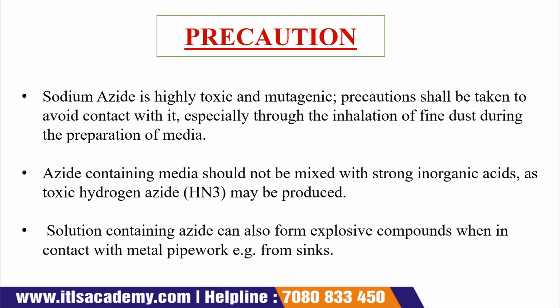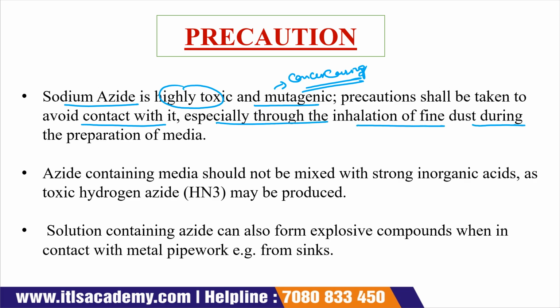Now the next is the precaution. When we perform this experiment, we have to take some precautions. Sodium azide is highly toxic in nature and mutagenic. Mutagenic means cancer causing. That's why when we are handling this media, we have to handle it very carefully. Precautions shall be taken to avoid contact with it, especially through inhalation of fine dust during the preparation of the media.